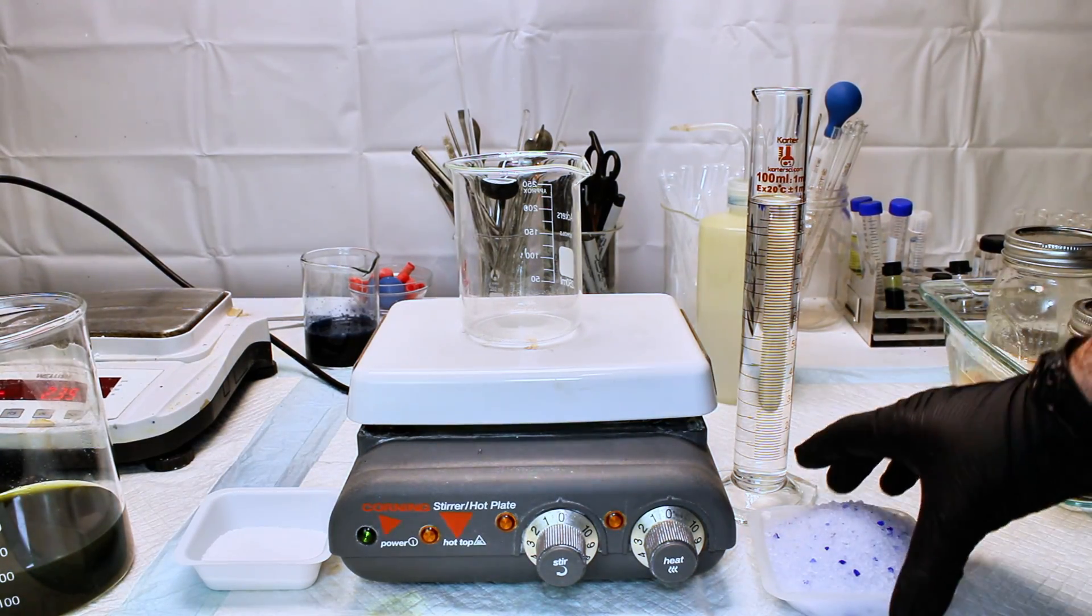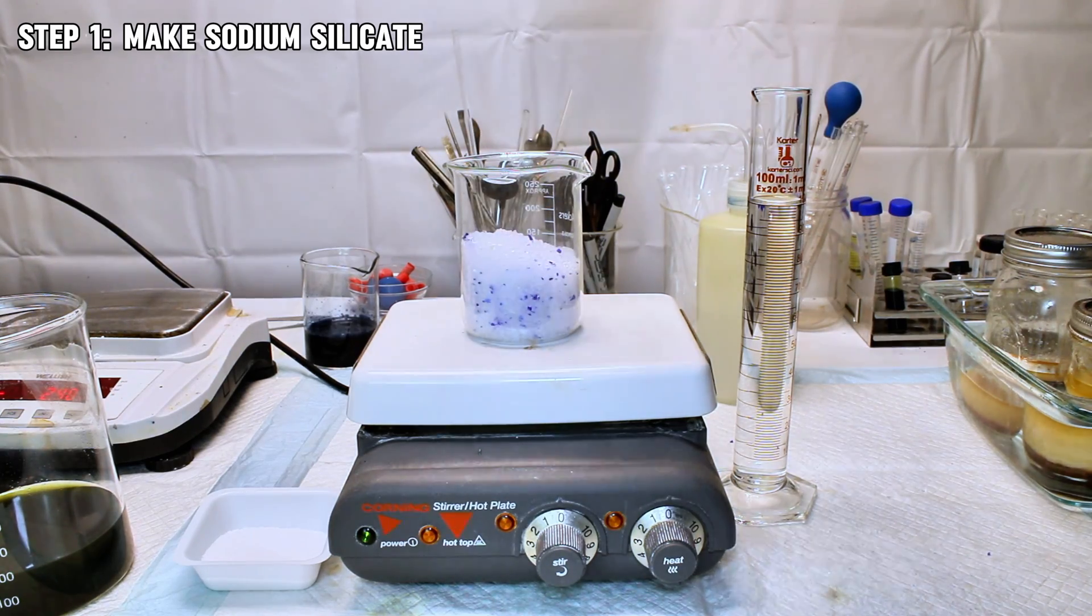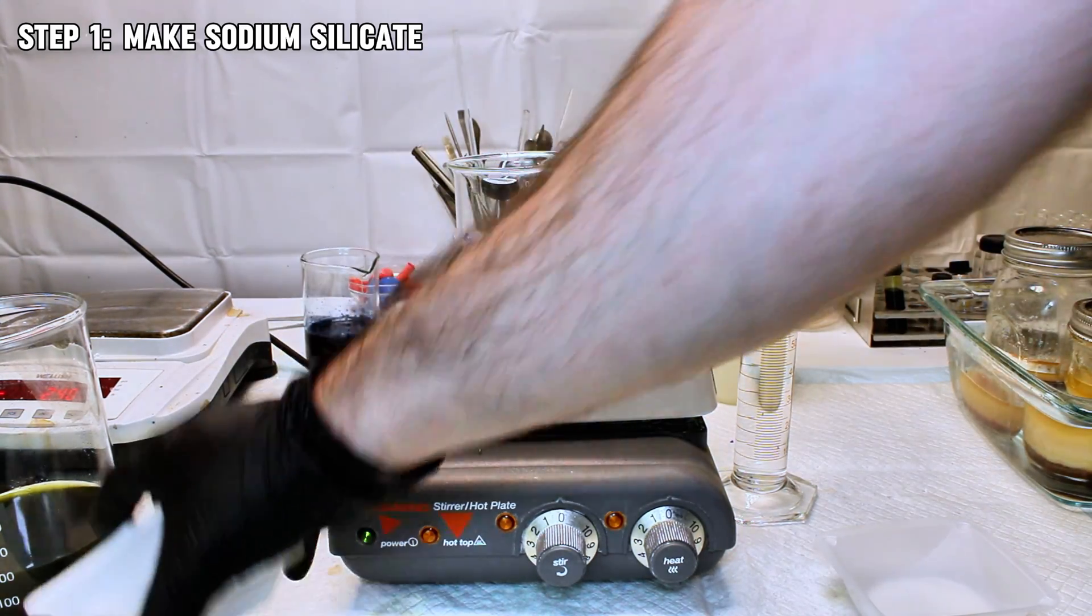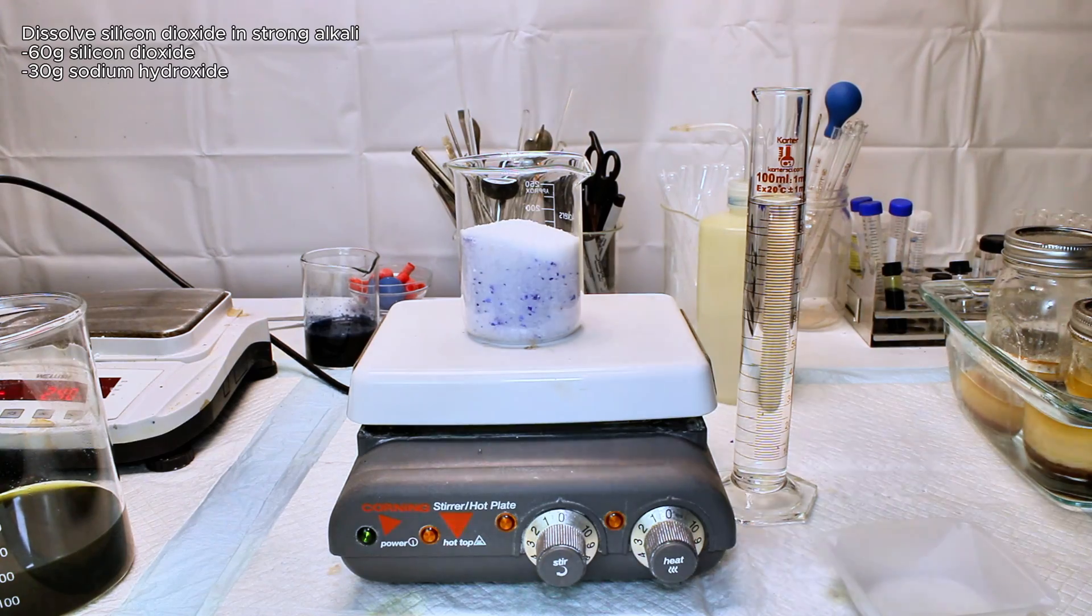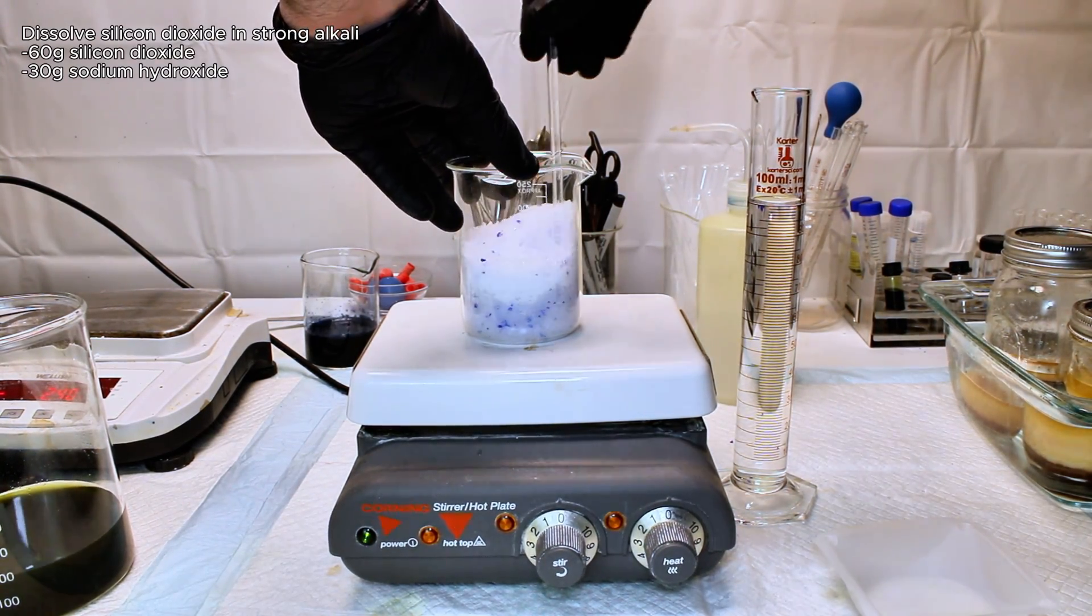To get started, I first needed to make some sodium silicate, as it isn't something I usually keep on hand. This can be done fairly easily by dissolving a source of silicon dioxide in sodium hydroxide, and my source of silicon dioxide here was crystal kitty litter.